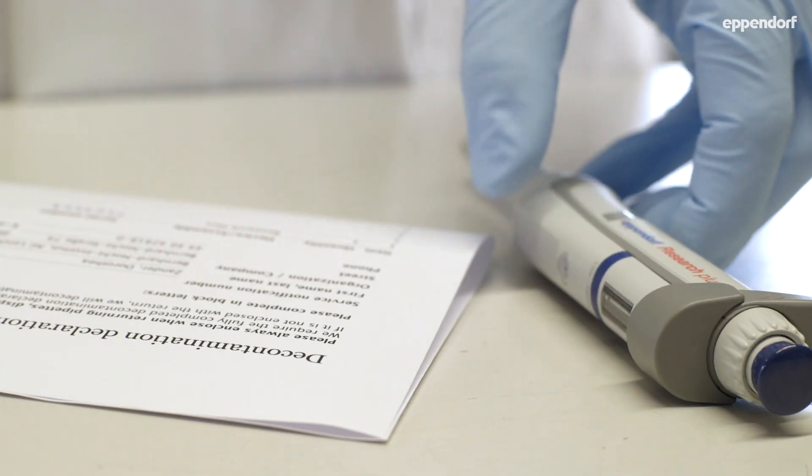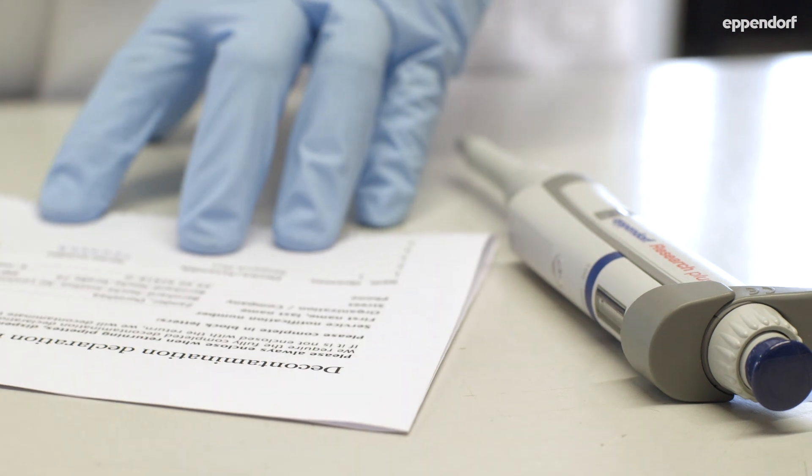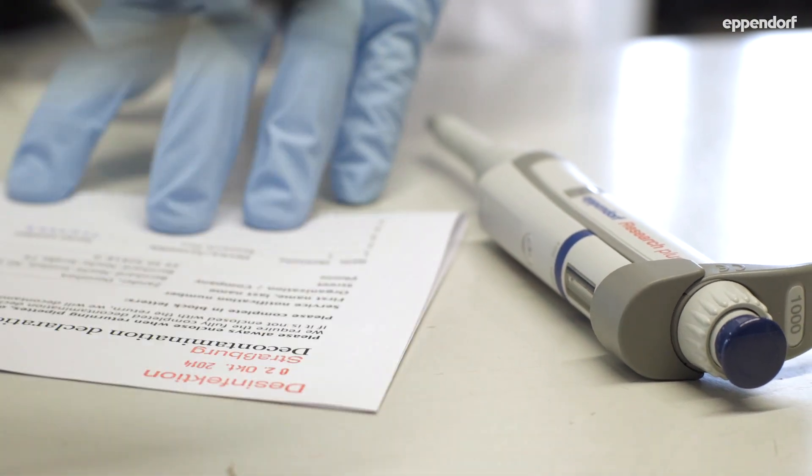Welcome to our Eppendorf Pipette Service Center. We are committed to offering you world-class service.